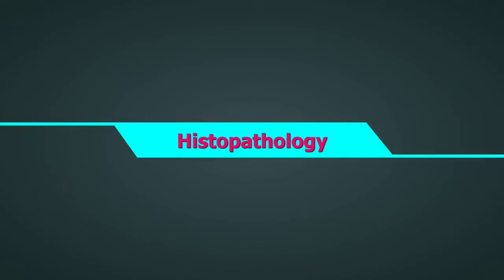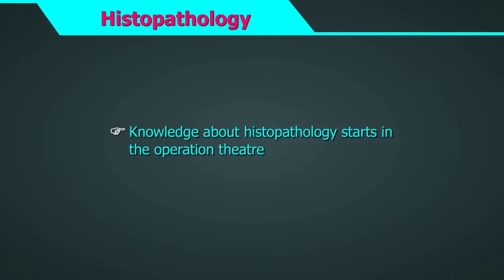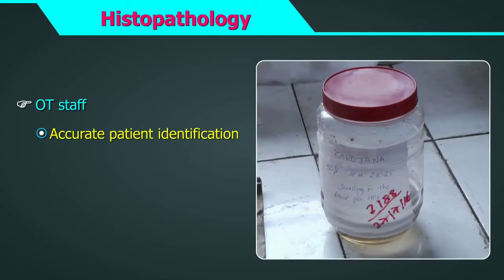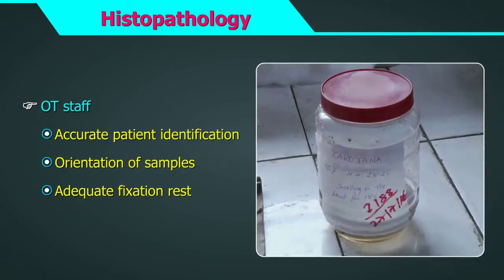Histopathology. Histopathology is a vast subject. The knowledge about histopathology should start in the operation theatre where the samples are collected. Accurate patient identification, orientation of samples, and adequate fixation rest in the hands of the OT staff.